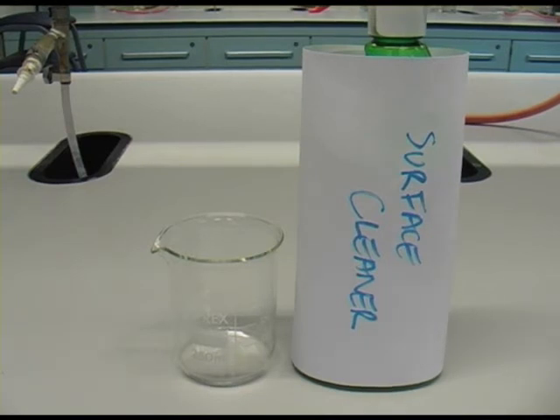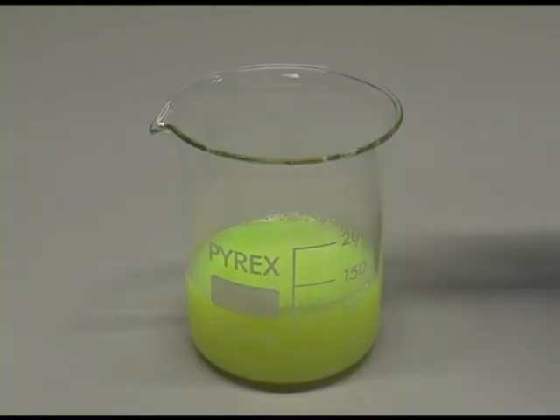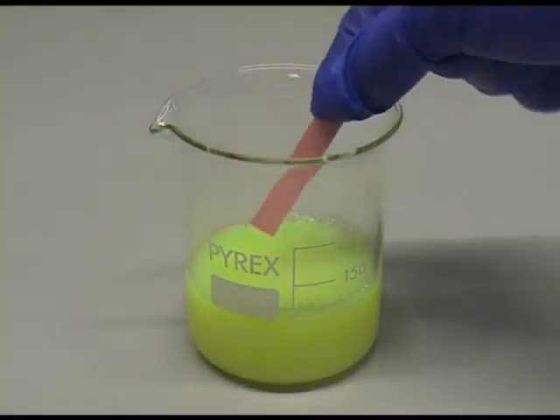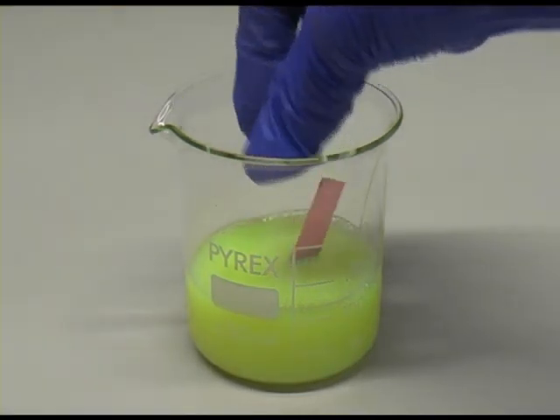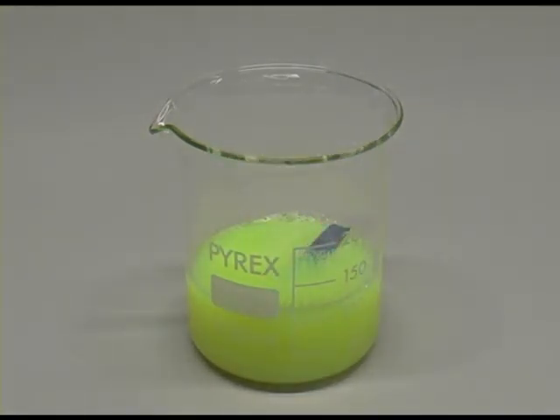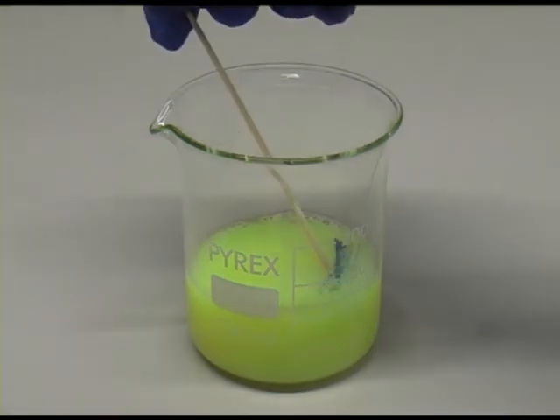What about surface cleaner? Well, let's find out. Here we have some red litmus. Pop it in the surface cleaner. And you can see already that it's gone blue. This means that the surface cleaner is an alkali.